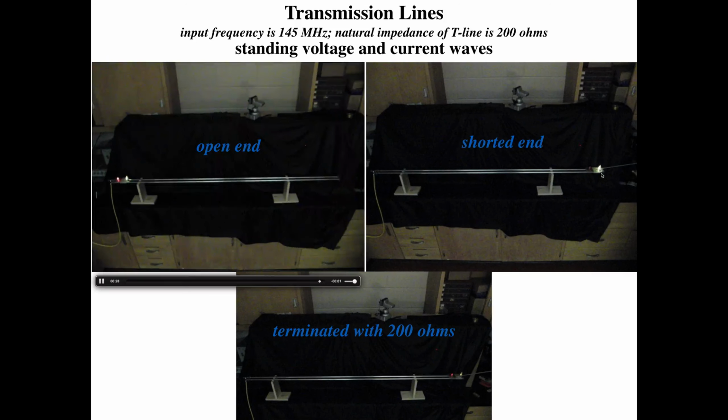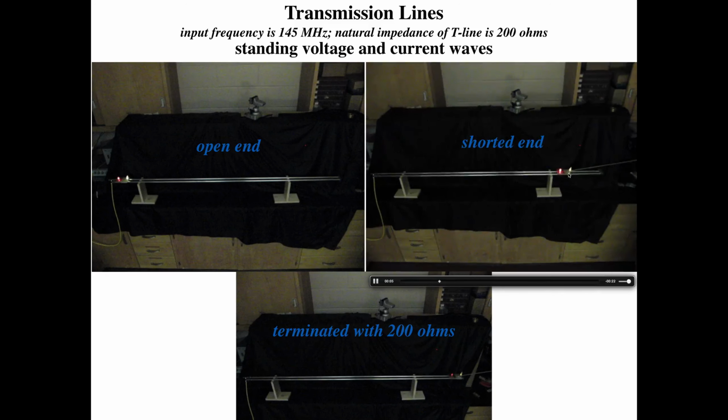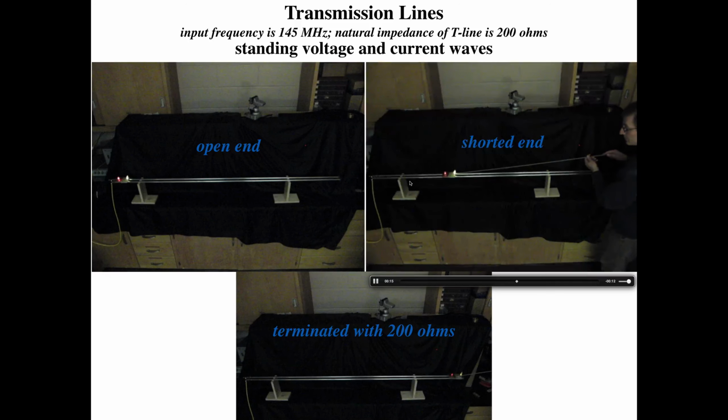We can do the same thing for the short. There's our aluminum short. Notice that here it starts just the opposite. The voltage indicator is low and the current indicator is high. And as we push down, we'll see the voltage indicator come on and the current indicator go off. And then as we keep pushing, you'll see that the voltage indicator again goes low, low voltage, high current, and so forth. Again, you can imagine that there's a sinusoidal pattern of voltage and current as we go along the line. So the impedance depends on the position and so forth.